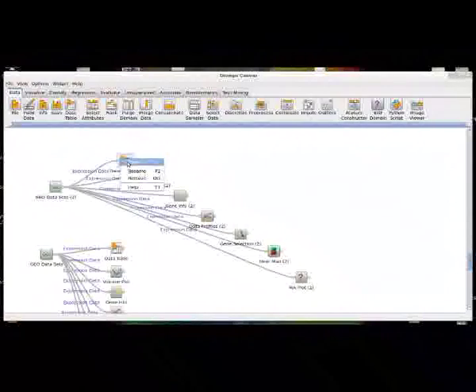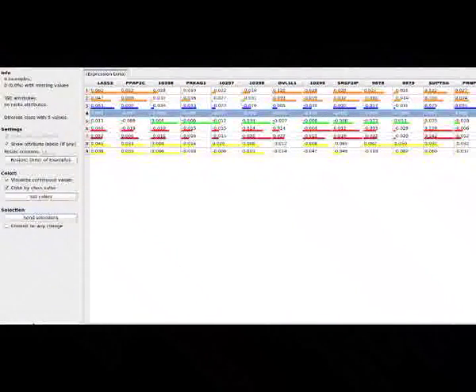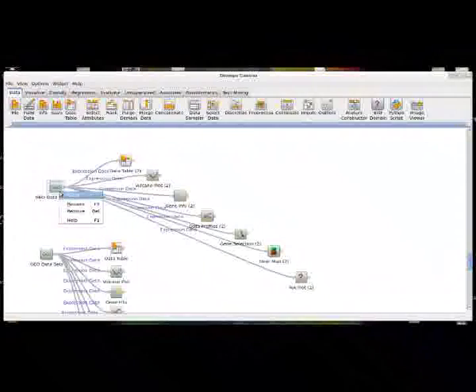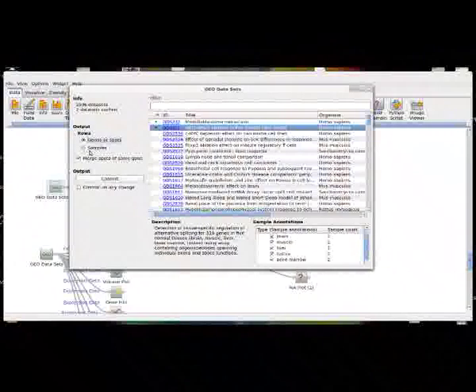So this is how we look at the data by samples with genes as our column headers, but what if we wanted to transpose this matrix? Well, the GeoDatasets widget makes that easy. So we can choose to transpose our output based on genes or samples. We were looking at samples before, which means that each different row is an individual tissue sample.